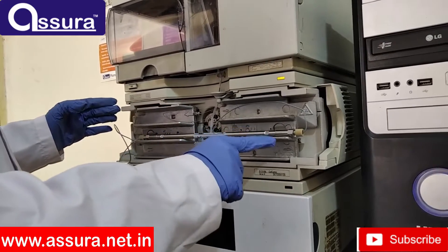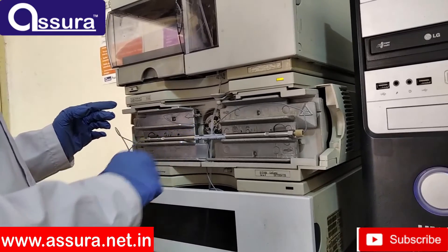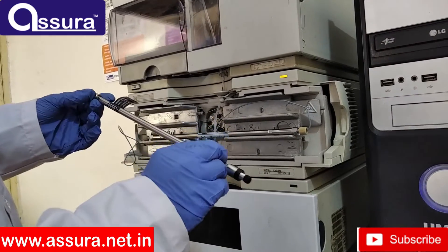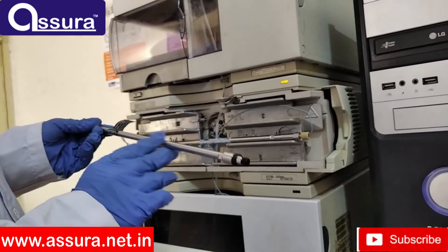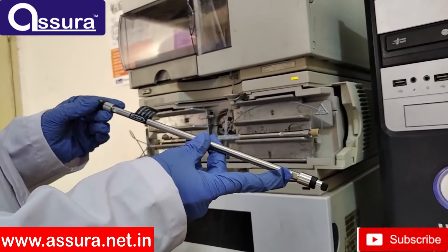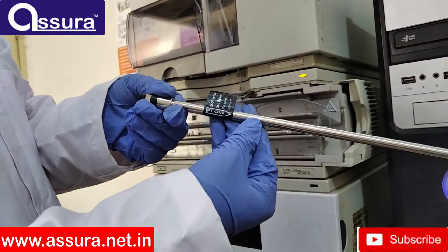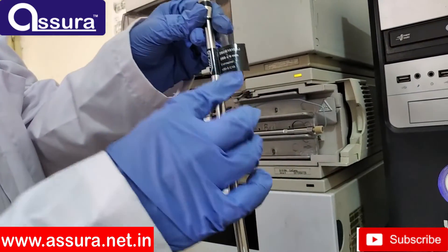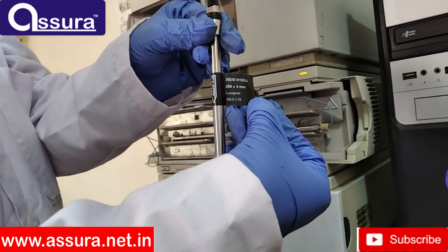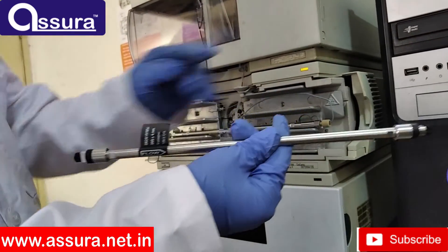The column compartment helps achieve better separation of the sample — it is the heart of HPLC. It is used to separate components from the system. The column has a stationary phase which is covered with a layer of carbon chain C8 or C18. Column performance is checked when first used for analysis. The column must be connected to the system as per the flow direction given on the column. Length, inner diameter, and particle size in microns of the stationary phase — all this information is written on the column. The column is closed with end fittings as shown.